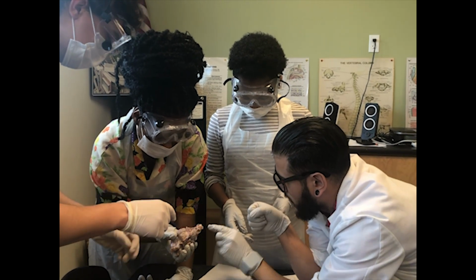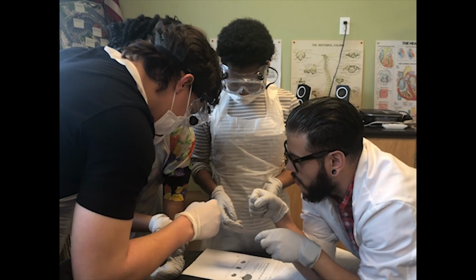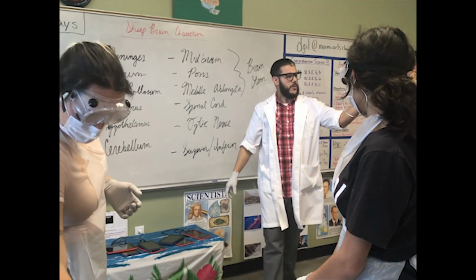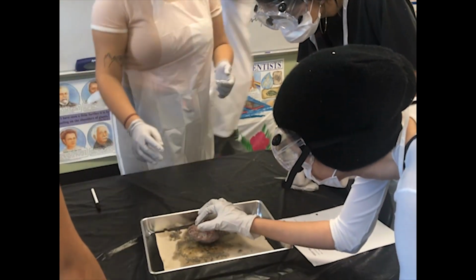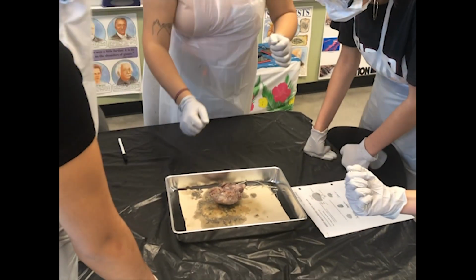And then what's this white tissue tip right here? That's cartilage. That connects with what? The spine. Where do you think the eyes would connect from? Find the optic nerves. Is this little baby the optic nerve? Oh, crazy. Find the optic nerves.